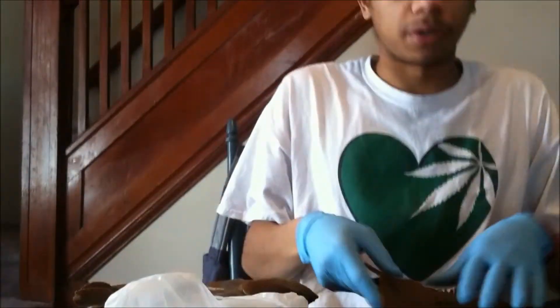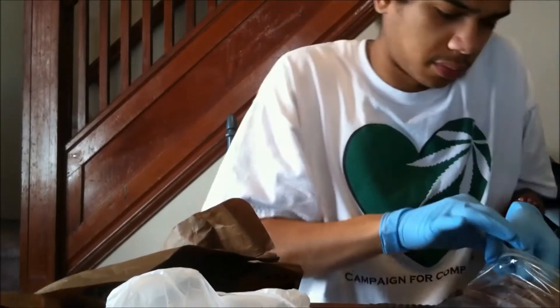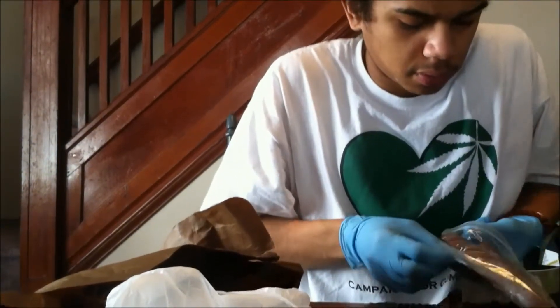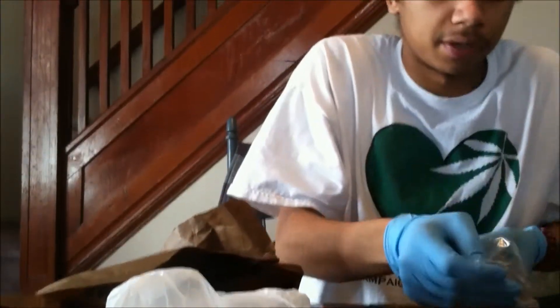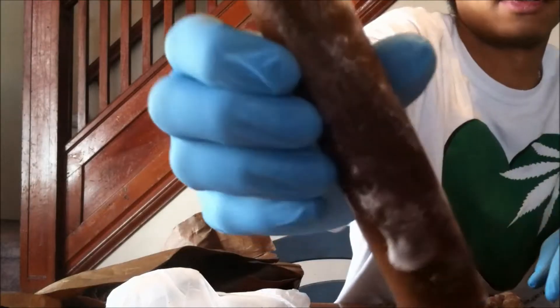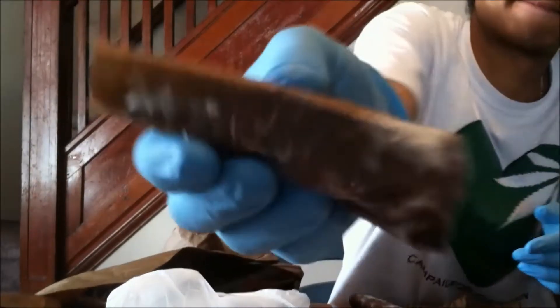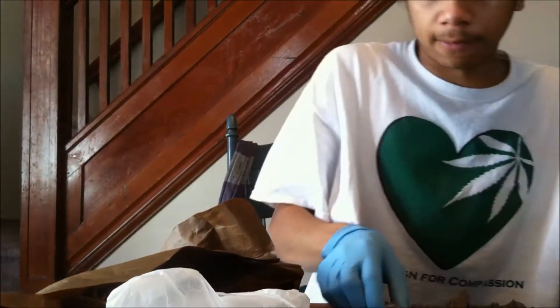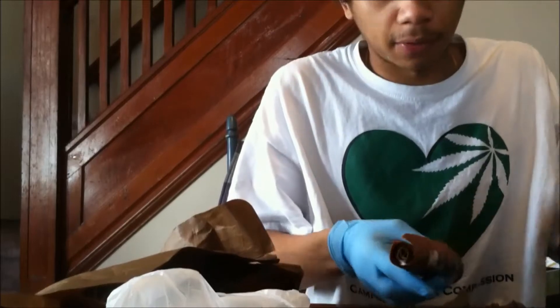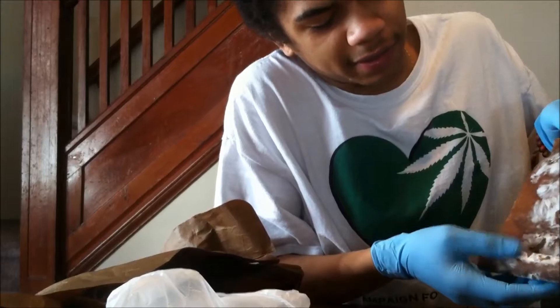We're going to take our first starter culture. These two kind of fused together over the week — just open it up and look at all that mycelium.